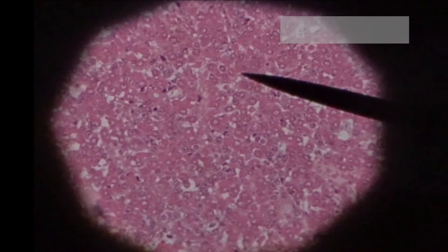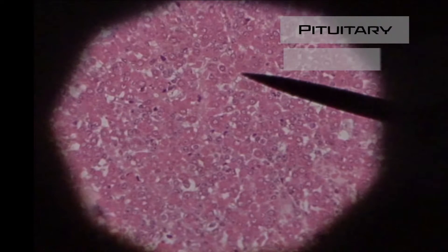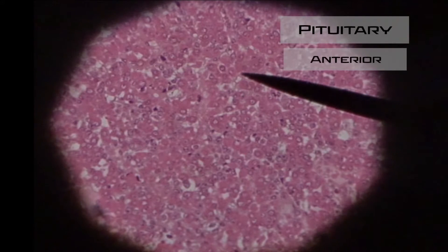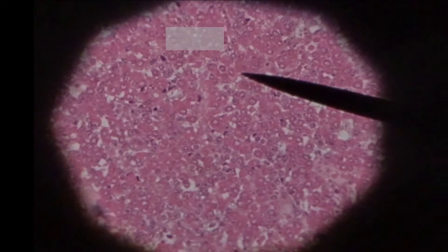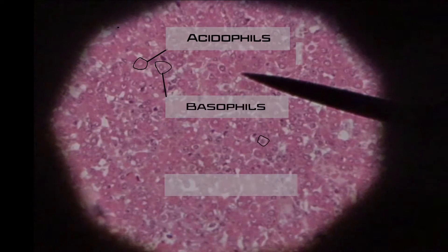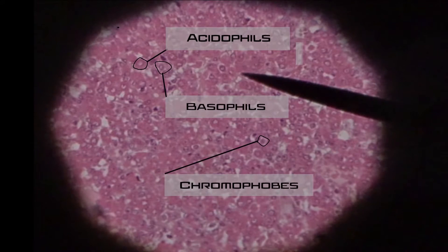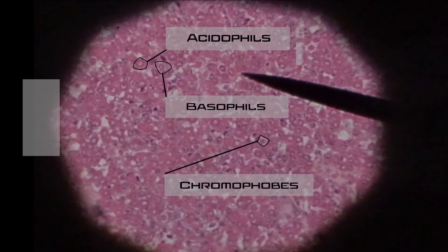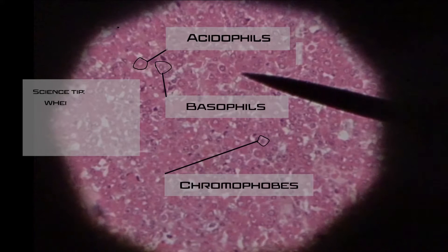What we're looking at now is a slide of the pituitary gland. There is an anterior and posterior portion to the pituitary, so we're looking at the anterior right now. There are three cells you should be able to identify: acidophils, basophils, and chromophobes. With the acidophils, they usually stain a more hot pink color — they got their name because of the staining process, acidophil meaning love.